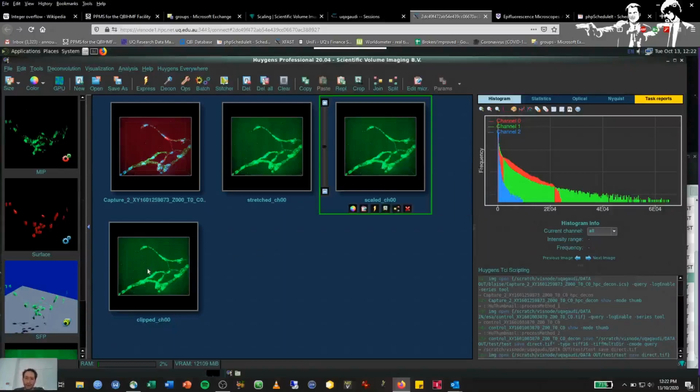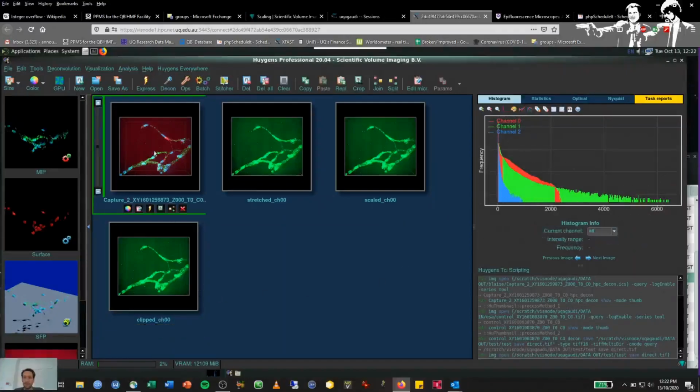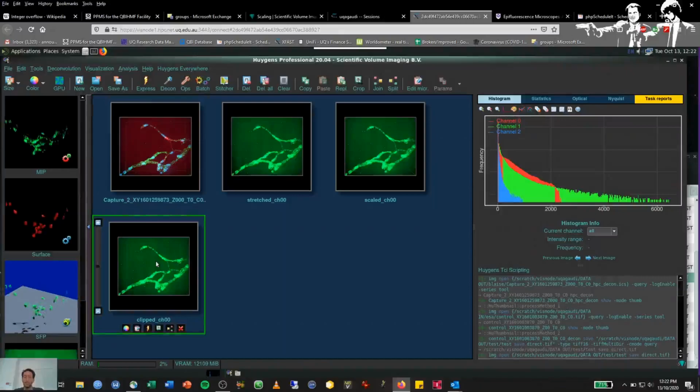Now, the third and last option is clipped. And as you can see, if you compare the histogram of the clipped option to the original, it hasn't moved at all. That's the idea of clipped. It just takes whatever the original value out of the convolution is, and doesn't change anything. This is it.